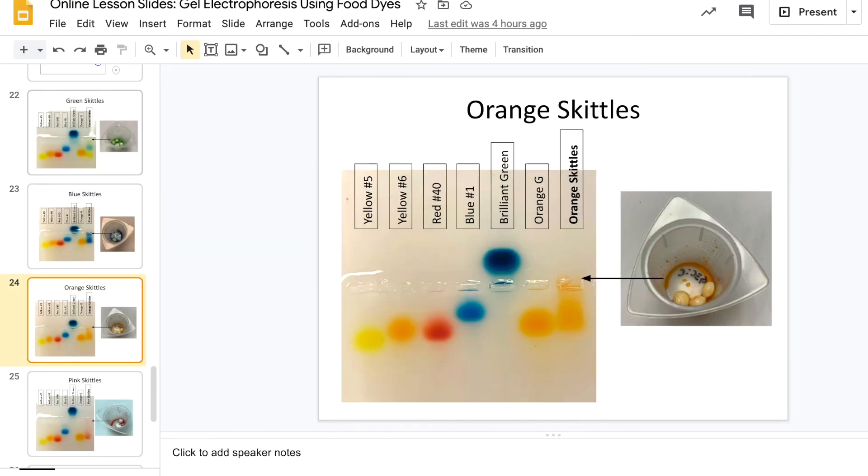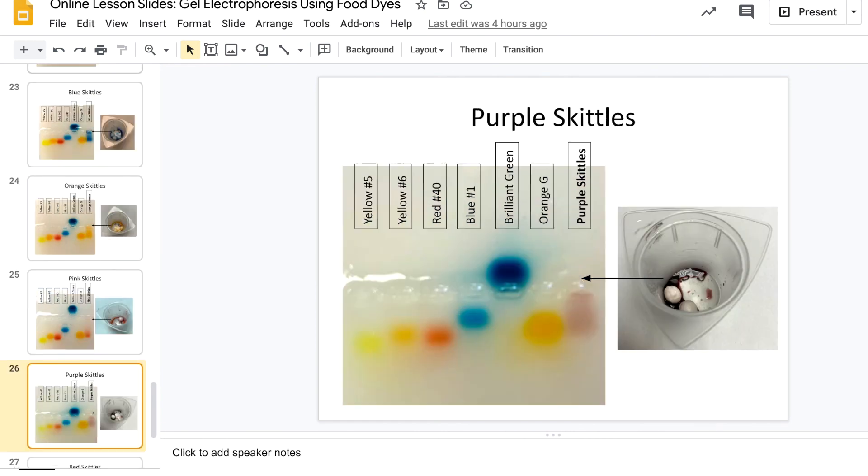Now, as the gel runs, it gets warm, so we've got some condensation on top. So head back to our lesson slides to view the results of our agarose gel electrophoresis.